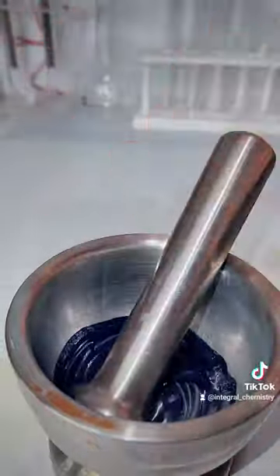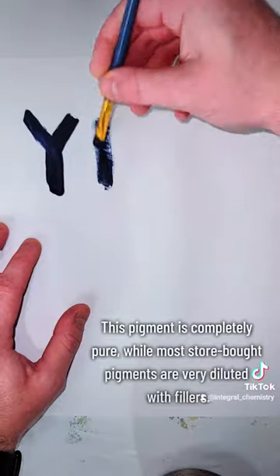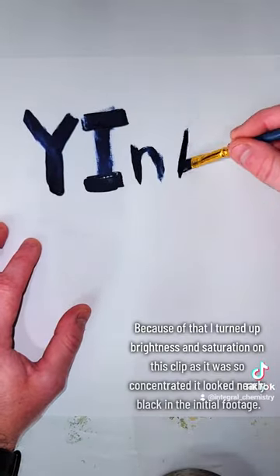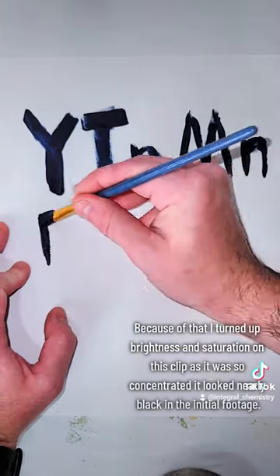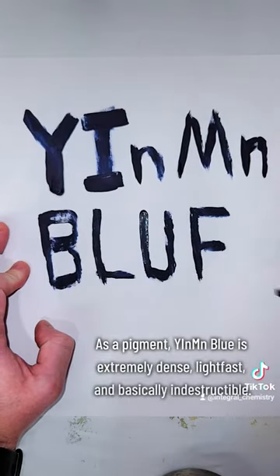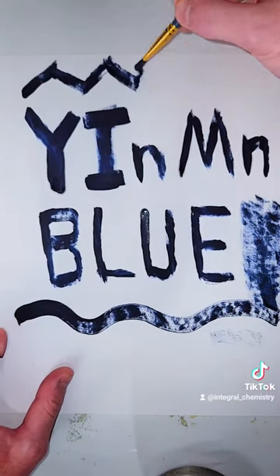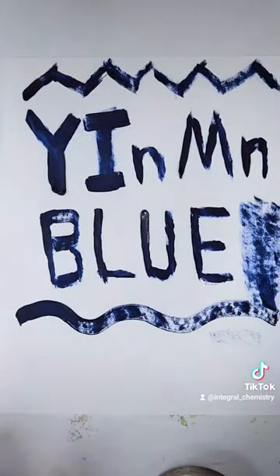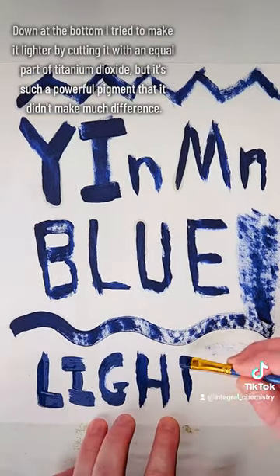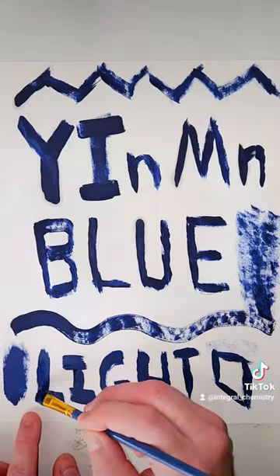This pigment is completely pure, while most store-bought pigments are very diluted by fillers. The issue is that because this pigment is so extremely concentrated and pure, it looks almost black on this piece of paper. To remedy that so you can actually see the color, I turned the saturation and the brightness up a little bit, so my hands don't actually look that pink. I also tried to dilute my blue pigment with an equal part of titanium dioxide, but this pigment is so unbelievably strong and opaque that it didn't really make much of a difference.